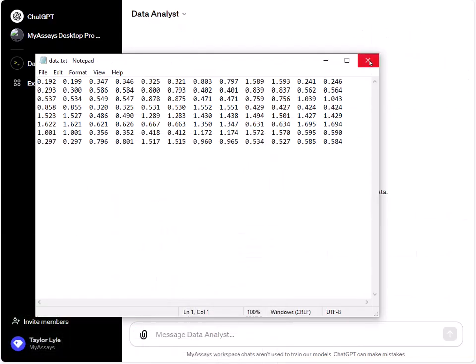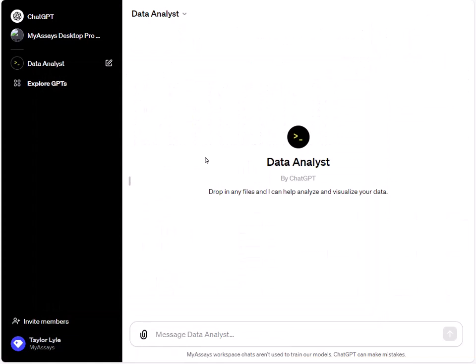To begin, I'll open the Data Analyst GPT option in ChatGPT. This is a text-based tool for performing data analysis. Using this text box, you can enter parameters for your analysis. First, I'll enter the prompt requesting assistance with the performance of an ELISA analysis.